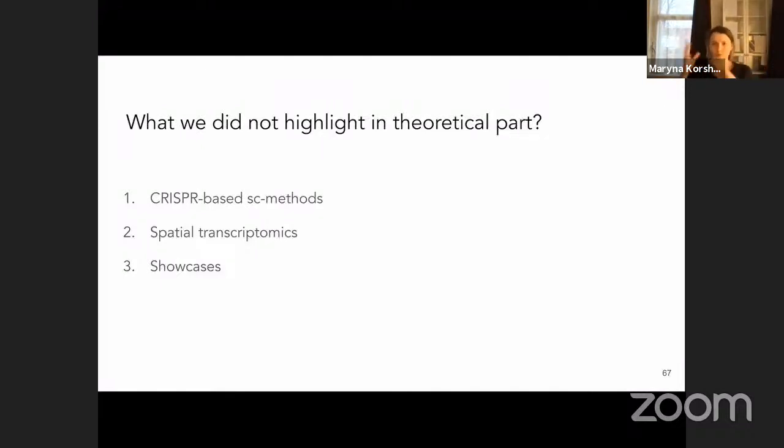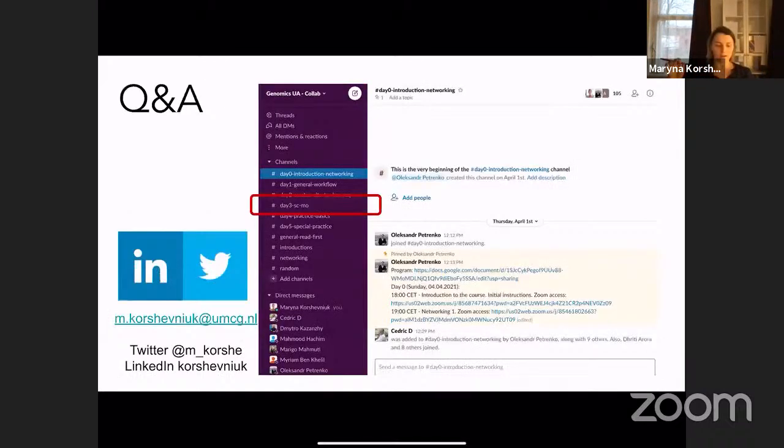single cell multi-omics, by observing showcases like publications, or talks and presentations by people who did this comprehensive analysis and review. Starting from sample collection, setting or selecting the hypothesis that you are going to test, through to data analysis and result interpretation. Sorry, please, for taking an extra 10 minutes on the theoretical part.